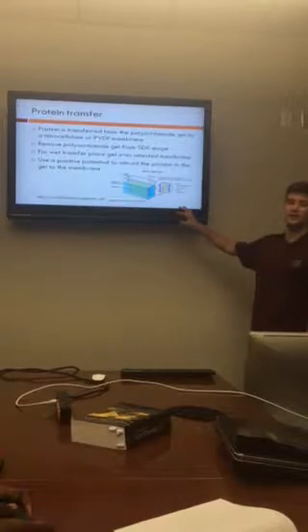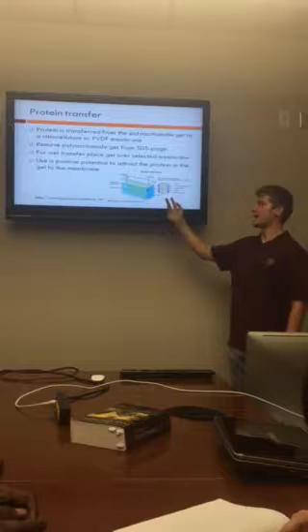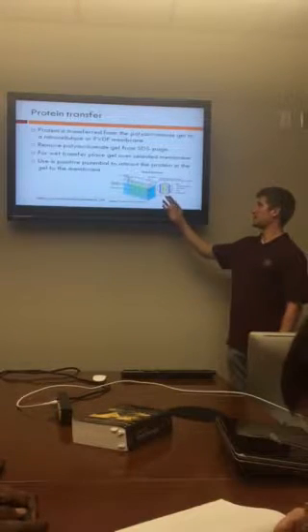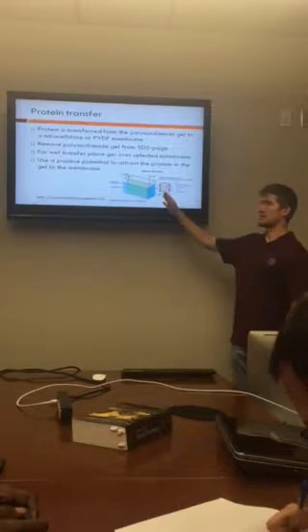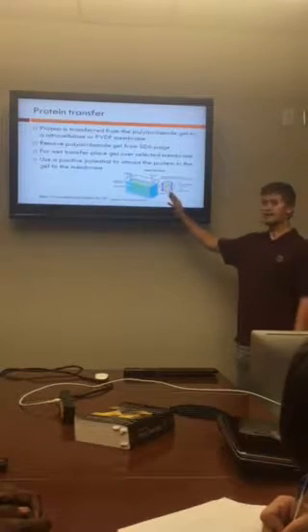And the steps are shown in the visual aid here. You start with 2 support grids, and then have pads and filter paper. And then your polyacrylamide gel is in the green, and your transfer membrane is in between.